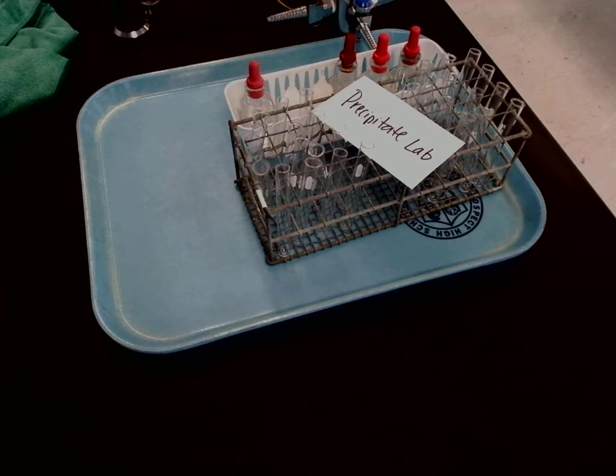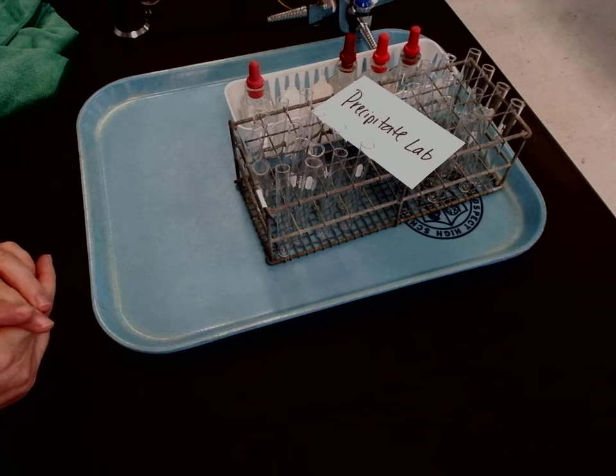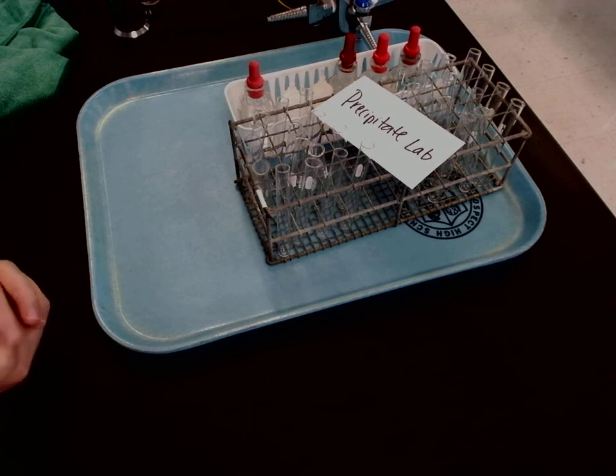Scroll past the procedure and you'll see a chart that has the ions and formulas of the substances I'm going to be mixing. In the chart, you're just going to be writing down if there's a precipitate or not, and you might want to jot down what color the precipitate looks like — that might be helpful.